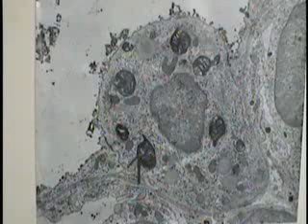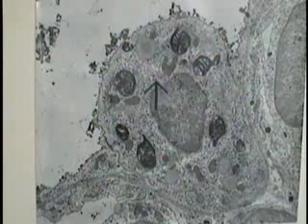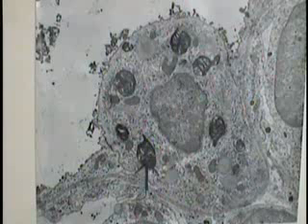That vacuolated material, as seen at the light microscopic level, appears in electron micrographs as these myelin or laminated bodies. These are the bodies that contain surfactant, which is being produced by the type 2 pneumocyte.